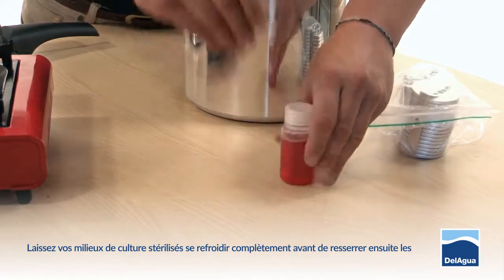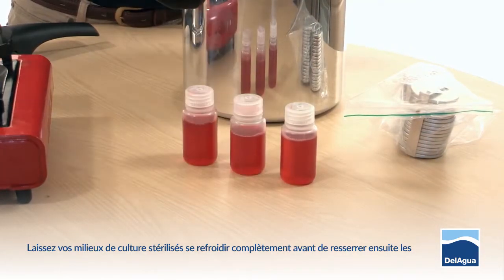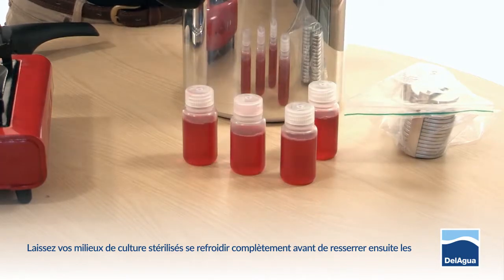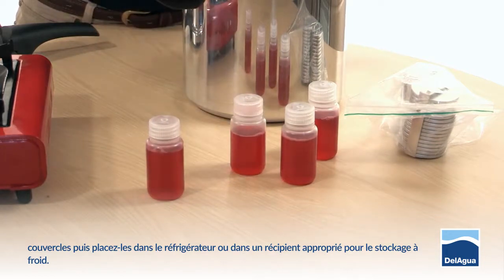Allow your sterilised media to cool completely down before you then subsequently tighten the lids and place them into the fridge or a suitable cold storage container.